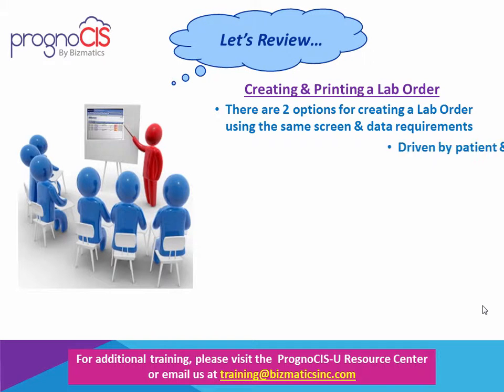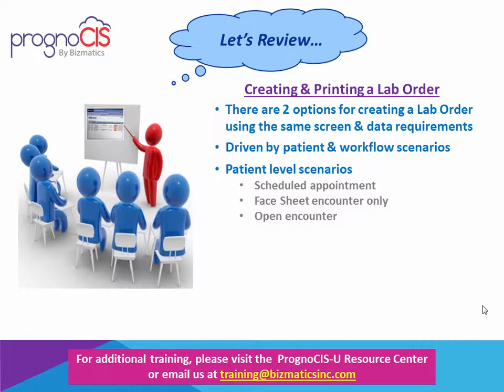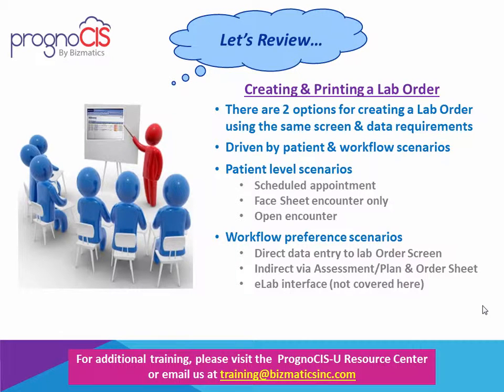So in review, with regards to creating a lab order, there are two options using the same screen and data requirements. These options are driven by your patient scenarios as well as your workflow preferences within the practice. Patient scenarios would include, does the patient have an appointment? Do they have an open encounter? Or are you going to do it through their face sheet encounter only? Workflow preferences include direct data entry into the lab order screen, indirectly, where the physician would select the tests needed through the assessment and plan, and his clinician would follow up by completing the requisition using the order sheet, and of course the eLab option, which was not discussed in this video.